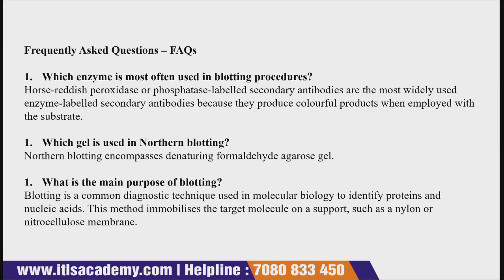Then comes what is the main purpose of blotting, meaning what is the main principle or aim behind the blotting. Blotting is a common diagnostic technique that is generally used in molecular biology. Why? Just to identify protein and nucleic acid. This method immobilizes the target molecule on a support such as nylon or nitrocellulose membrane. So these are certain important questions that can be asked in the interview.